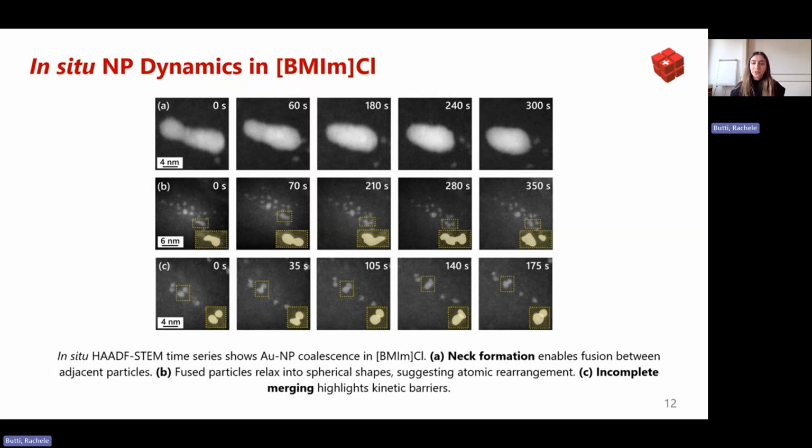Whereas in the bottom part of the figure, we have an incomplete merging, which highlights the difficulty or the kinetic barriers that these nanoparticles have to overcome.